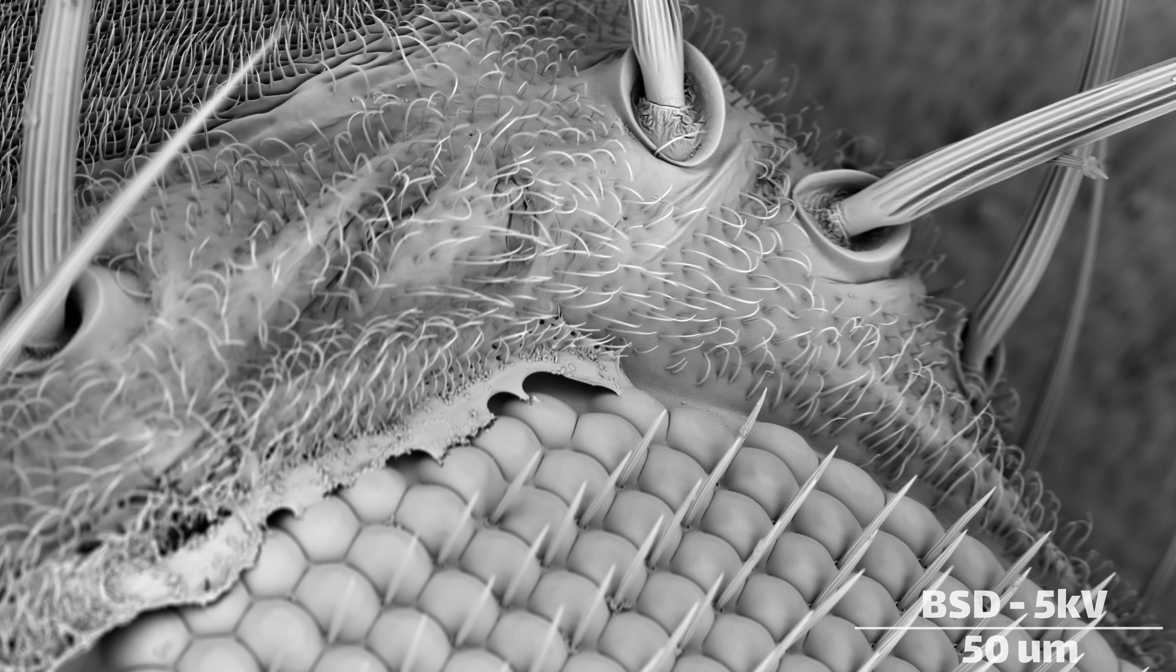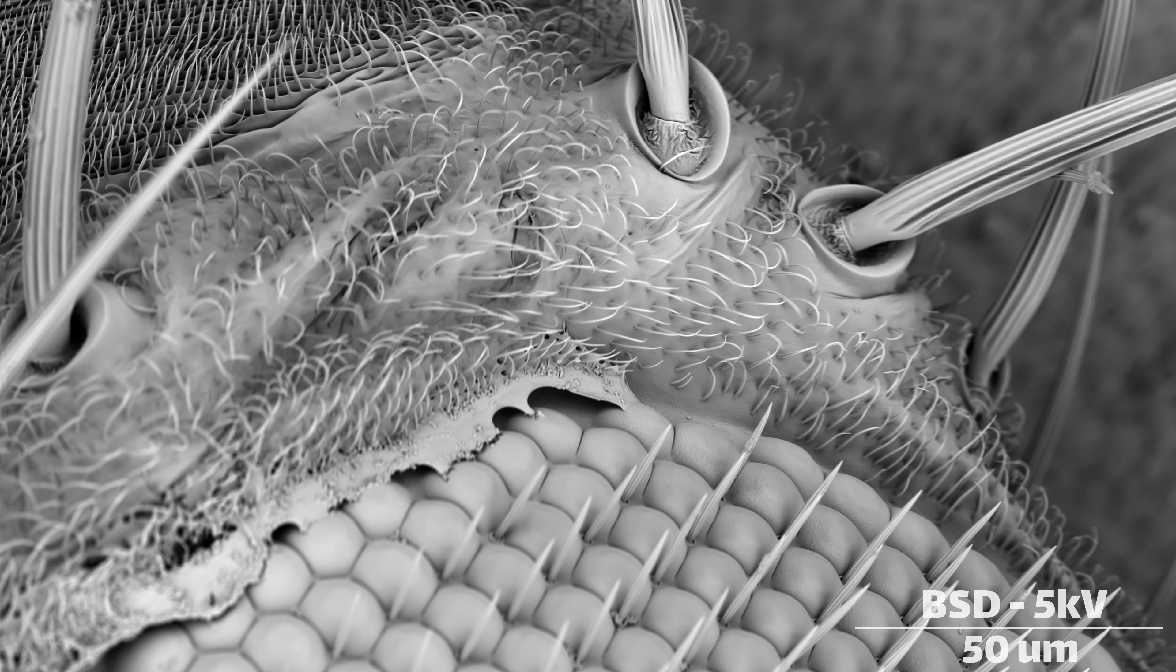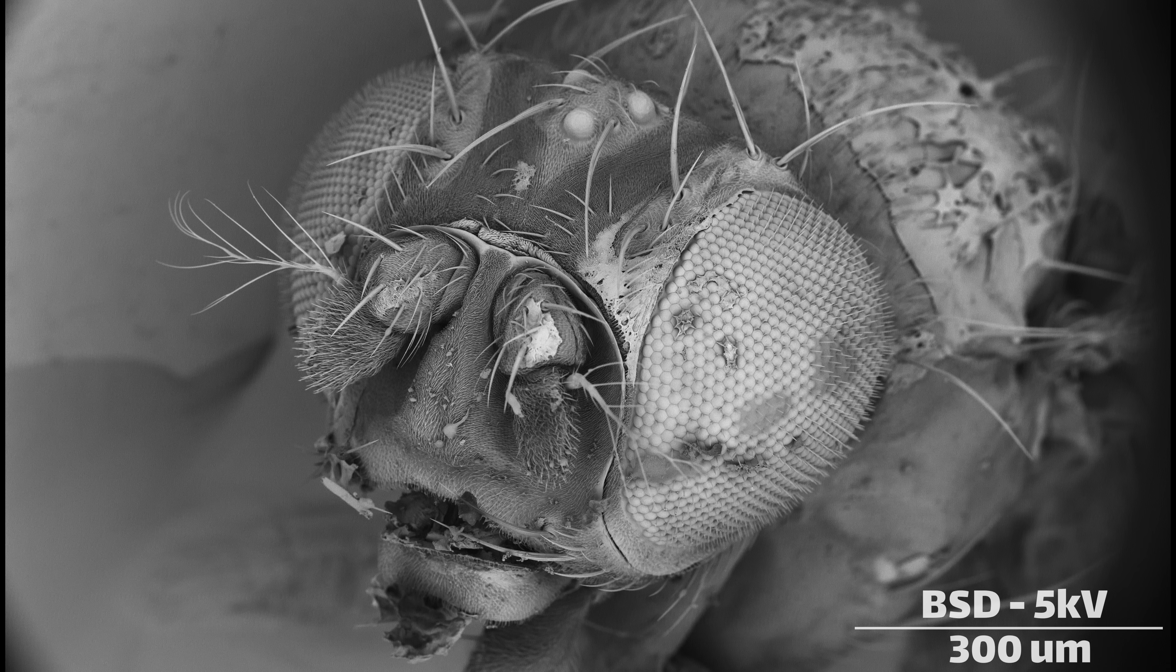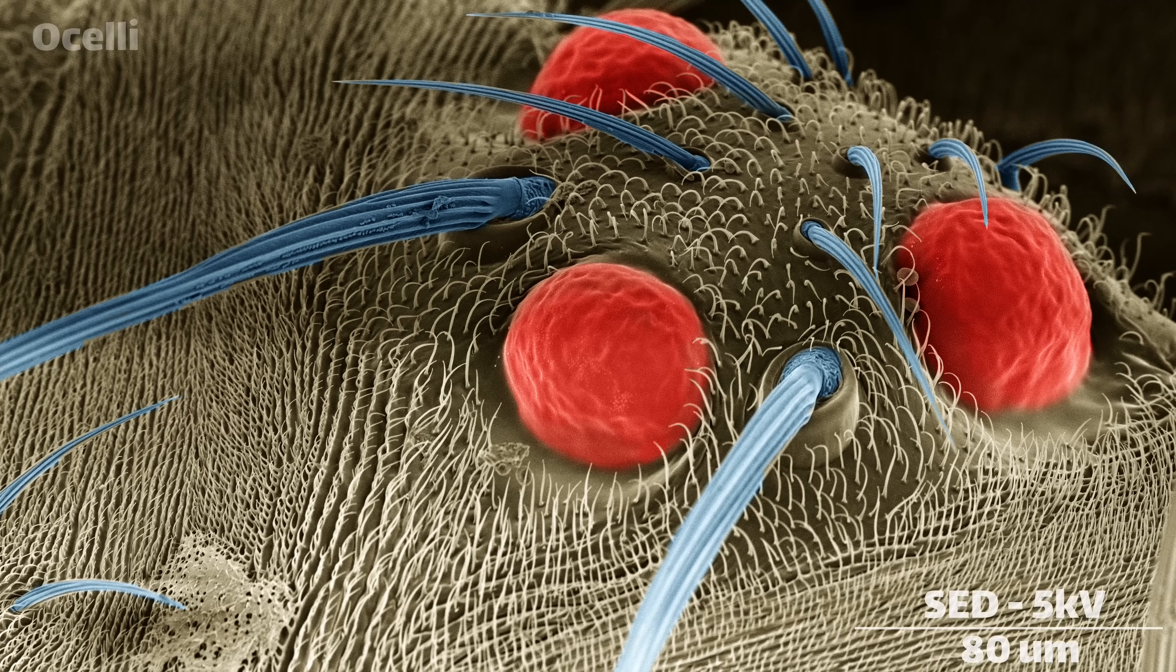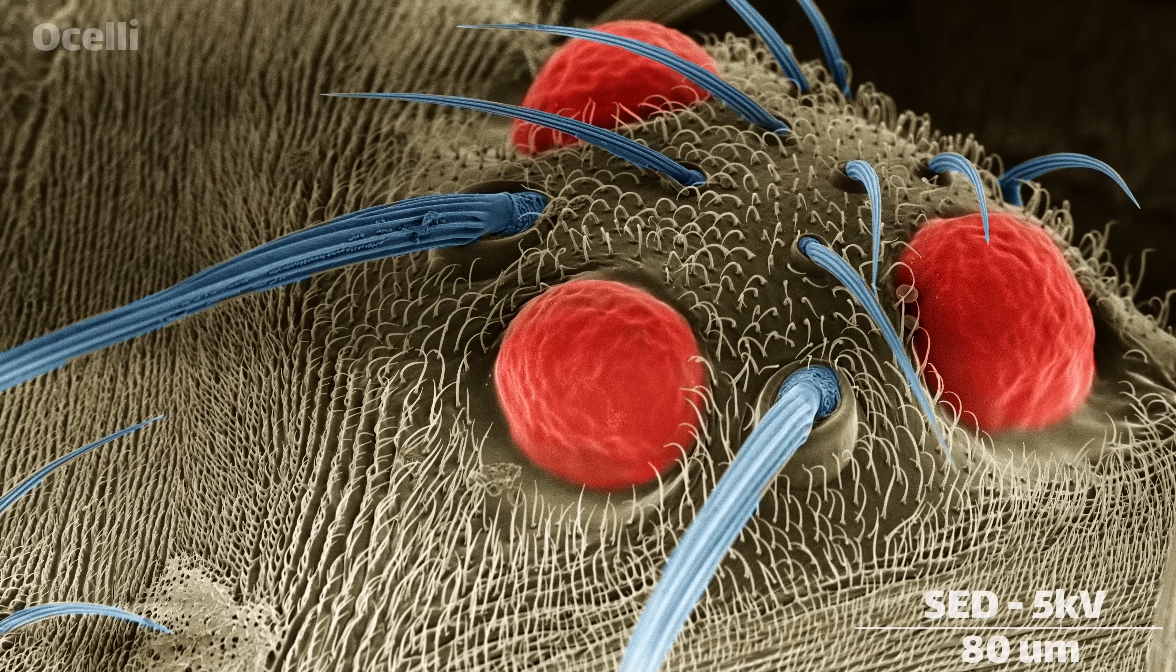Drosophila also have another organ that can sense light. These are called ocelli, and a fruit fly has three arranged in a triangle on the top of their forehead. Unlike the main compound eye, these have a single giant corneal lens with many photoreceptors inside.